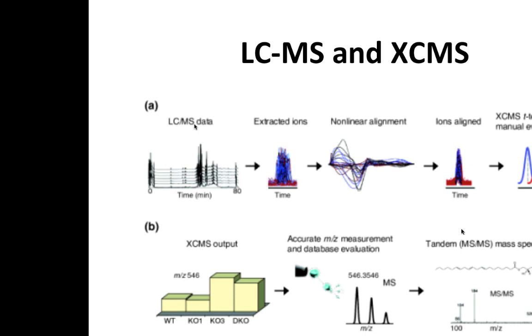I have a question actually. What is it selecting? For example, I have some noise in my data, which is quite significant. Will it align to this noise, or will it align to different ions and different peaks? What is it selecting? It will try to determine what's the baseline and what are the real features. Once it detects that, it will select the real features. This process is iterative. At the beginning, it makes a best guess. But once it processes multiple samples and realizes that at this position there is more likely a real feature, it will use a stricter threshold to detect it. So there are several rounds of selecting. Finally, you get all the peaks aligned and can see whether these features consistently appear across different samples. If a feature only appears in a few samples, it's more likely to be an artifact or noise. There are several tracks we are going to discuss later.